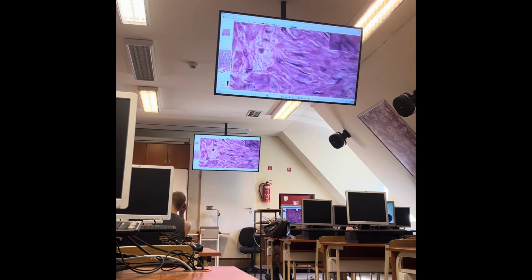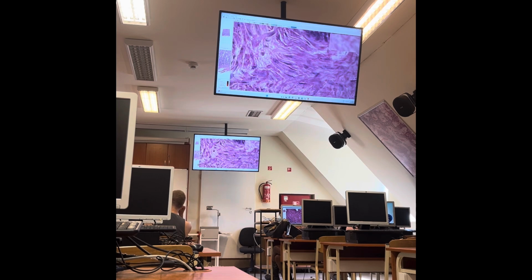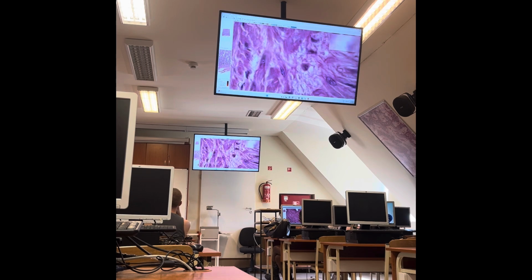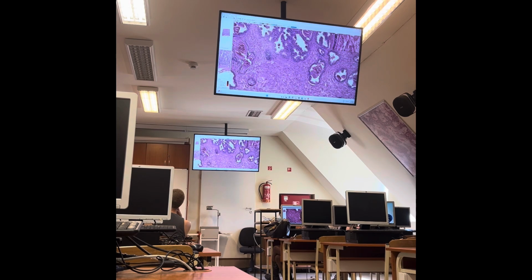nucleus with euchromatic staining. What do you think? What kind of cells are these? These are the smooth muscle cells. So in this way, we can see both cell types, smooth muscle cells and fibrocytes, and also the extracellular matrix of the connective tissue like collagen fibers. You can also see some unstained areas that is most probably occupied by the ground substance molecules. Okay, so fibromuscular stroma, this is what we can see.